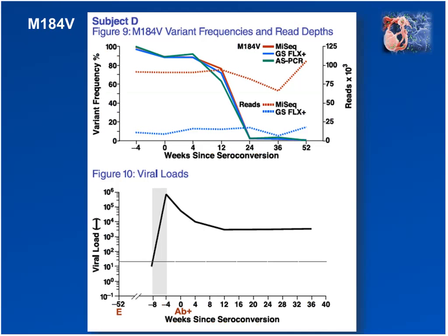So we're going to start looking at some of the variant frequency data, and we're going to start with subject D, actually. We're going to work backwards from subject D back to subject A. We're going to look at the variant frequency data for subject D at the drug-resistant site M184V, which, if you recall from my schematic earlier, is basically at the 3' end of the target region that we're sequencing. There's a single base change of an A to a G that results in the change of a methionine to a valine at this site.